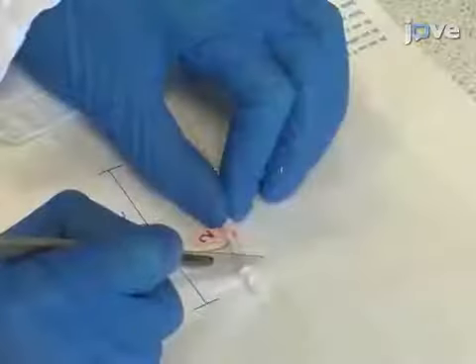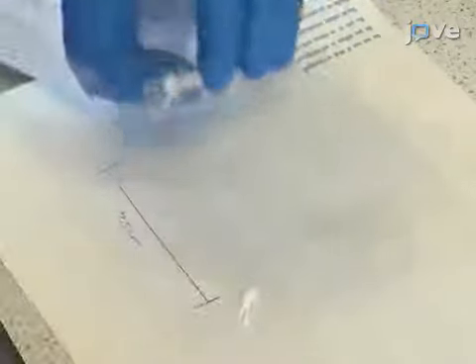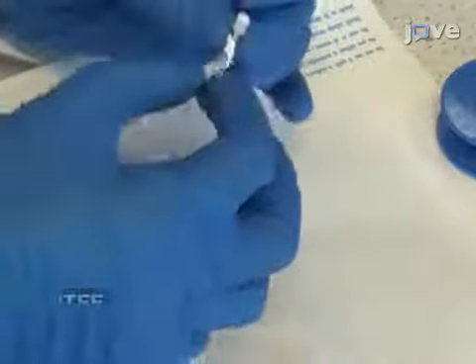Once dry, use a scalpel to cut the silicone so that it is flush with the glass module ends. Lastly, wrap about four layers of polytetrafluoroethylene tape around one side port.